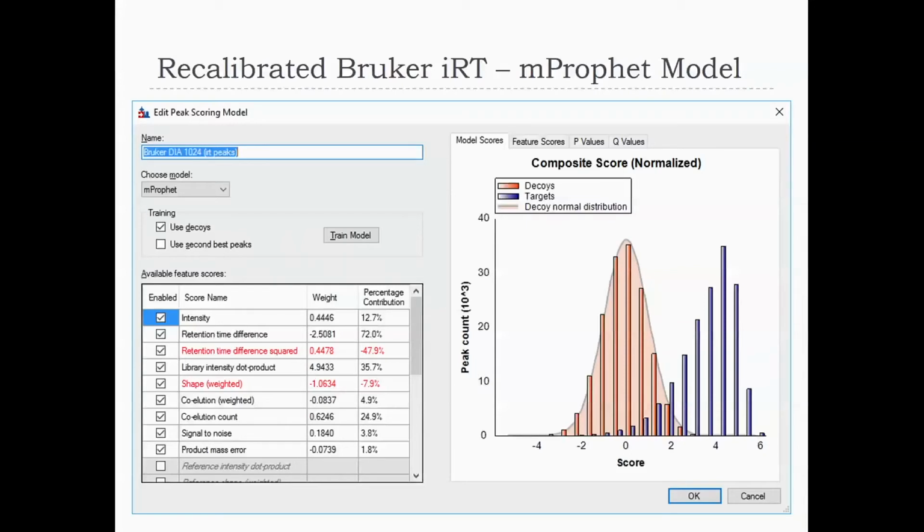All of a sudden our retention time becomes by far the strongest. These two sort of work in concert, or we think they work in concert. It was just sort of a guess, and we ran with it. But the weird thing has always been, Dario reported, wow, it works even better with retention time squared and retention time together, but frequently retention time squared ends up going the wrong direction. And we're like, that's a tuning score, it's probably great.